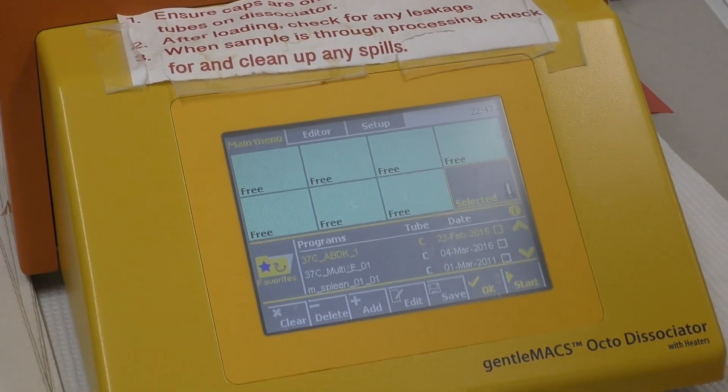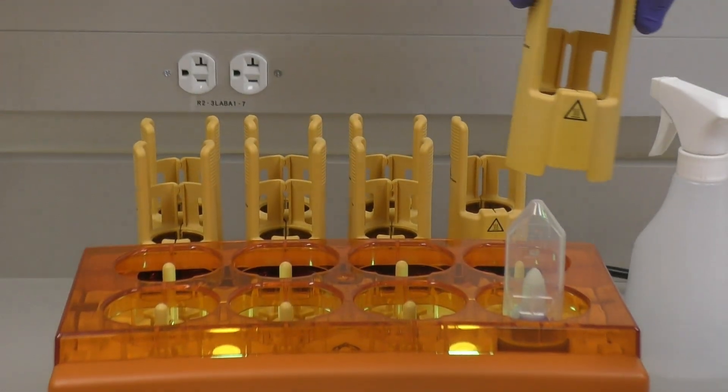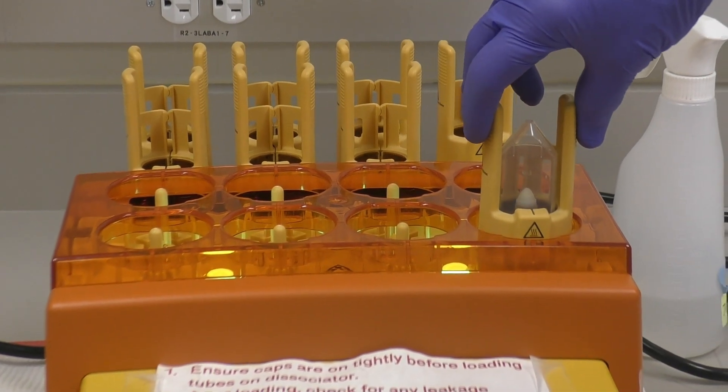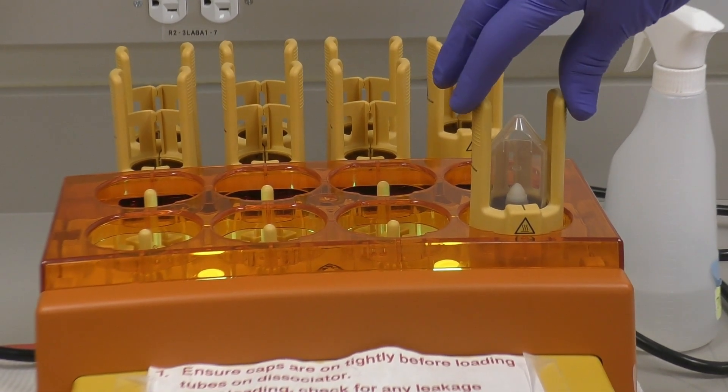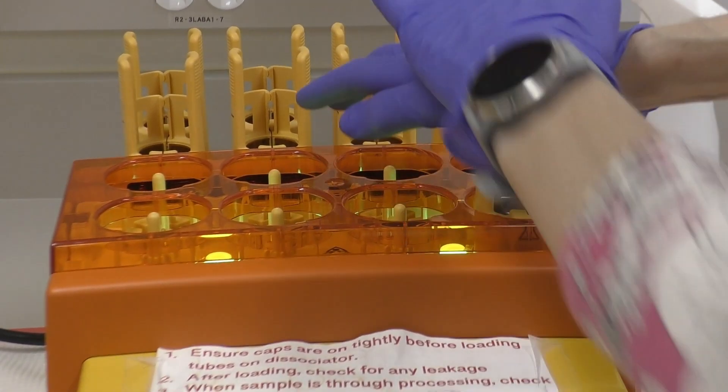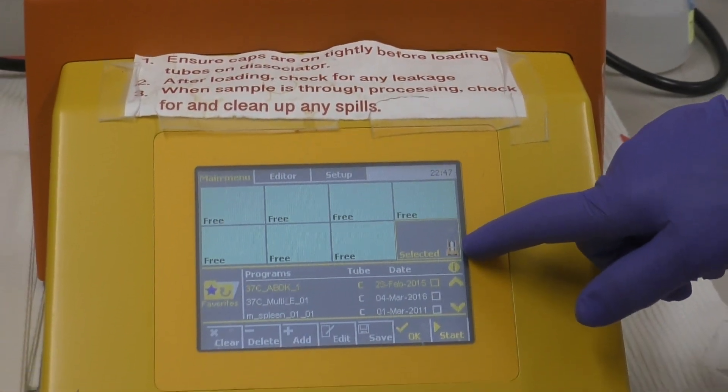After that, if a heater is needed, these are the heaters. Put the heater over the tube. The tube goes in first and then the heater. Push straight down until it clicks. The heater will be displayed on the screen.